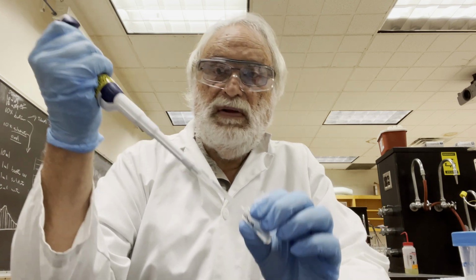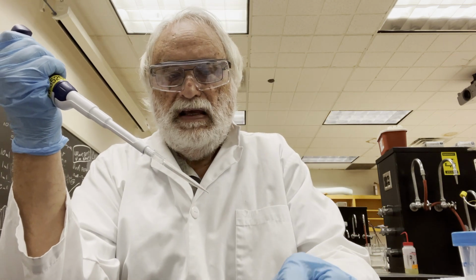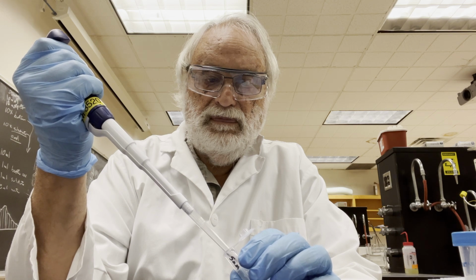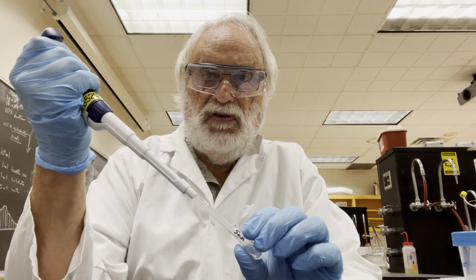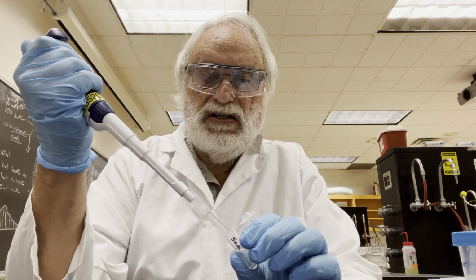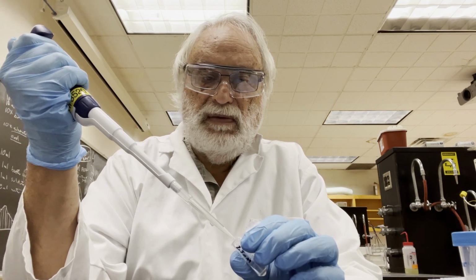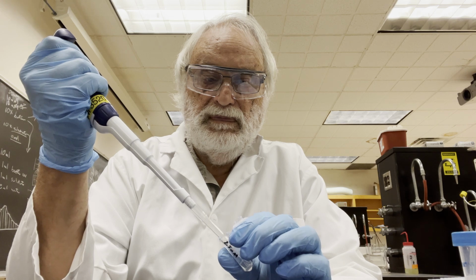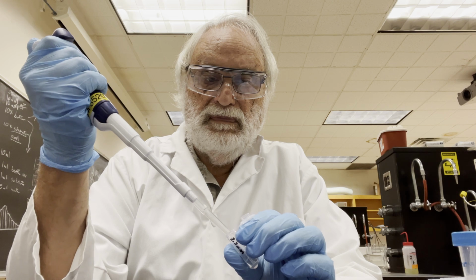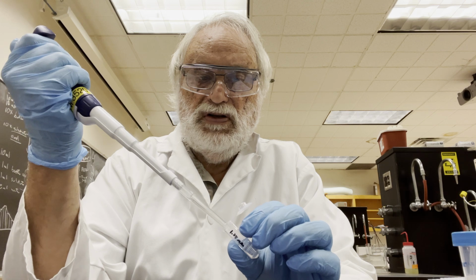And now I'm going to take 1 milliliter out, cap that tube, and I will add this to the tube labeled 5 millimolar. Just be careful doing this because these are 2 mL tubes and then we're adding 2 mL to them. So I'll take a milliliter out of the 5 millimolar and add it to the 2.5 millimolar. To the 1.25 millimolar.